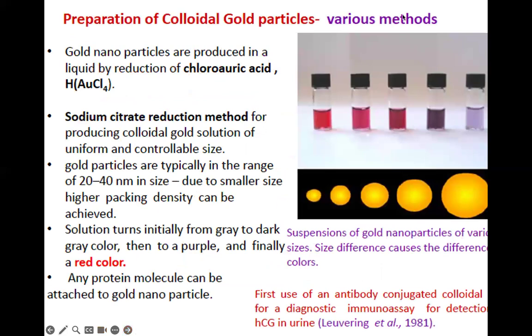Now, the next one is the preparation of the gold nanoparticles. Based on our experience, 40 nanometer is the best size for you to observe a very good test line.